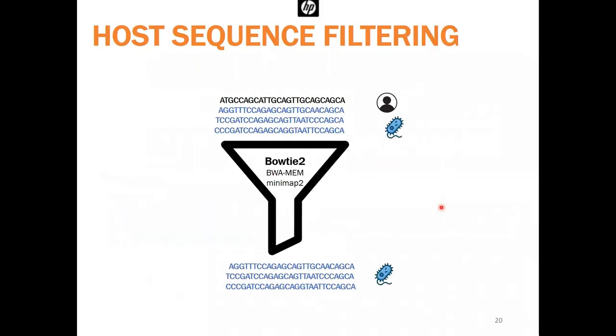Okay. So I mentioned earlier on, when I gave that basic workflow of bacterial genomics, that if a data set comes from a host with a sequenced genome, for example, human, a lot of clinical samples, right, they come from human. So it's really useful to identify and filter out host reads before any further analysis. Now, this can considerably reduce the number of reads, making subsequent steps faster. And this is maybe not as useful for single isolates, but for metagenomic data sets, extremely useful.